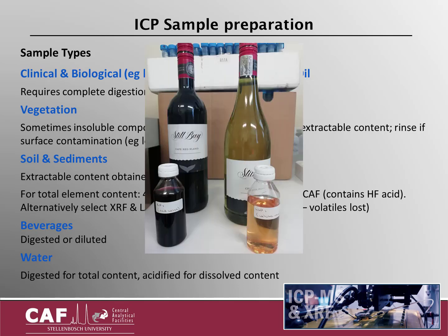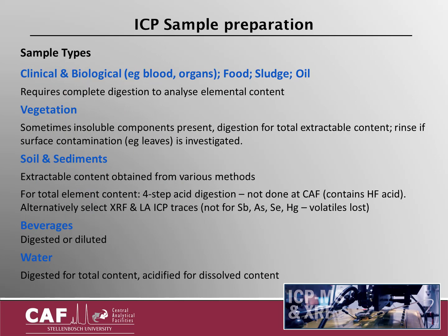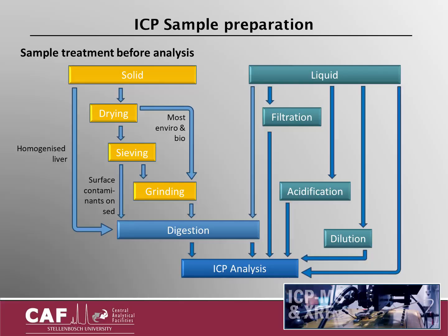Beverage samples for ICP analysis could be either digested or diluted. It will depend on the type of sample. Where you have water samples, it could be digested for total content if there is some turbidity in the samples, or it could just be acidified for the dissolved content.